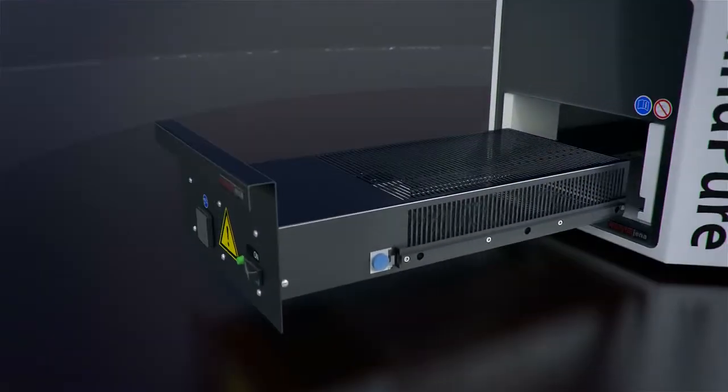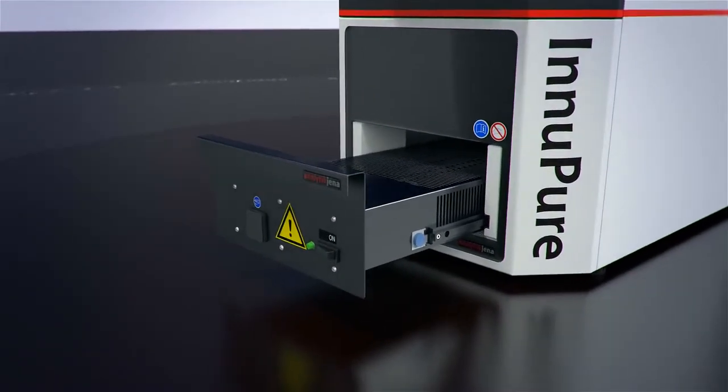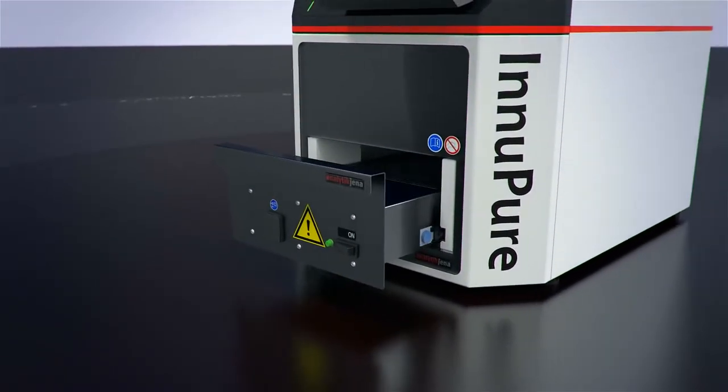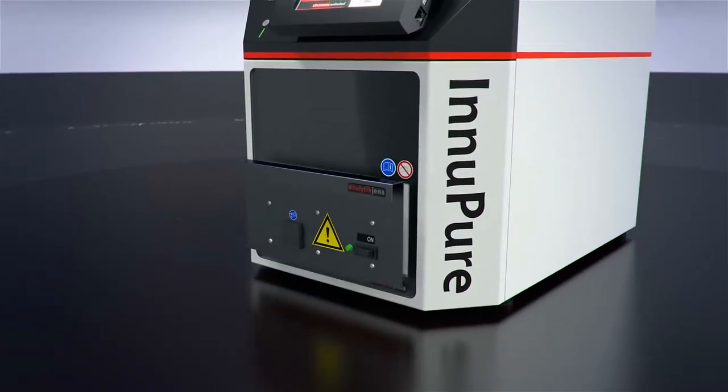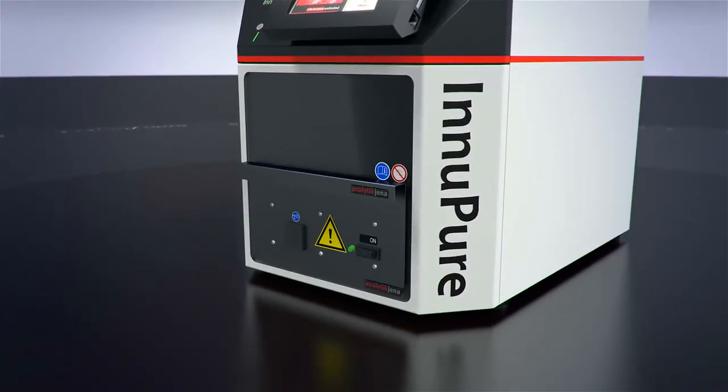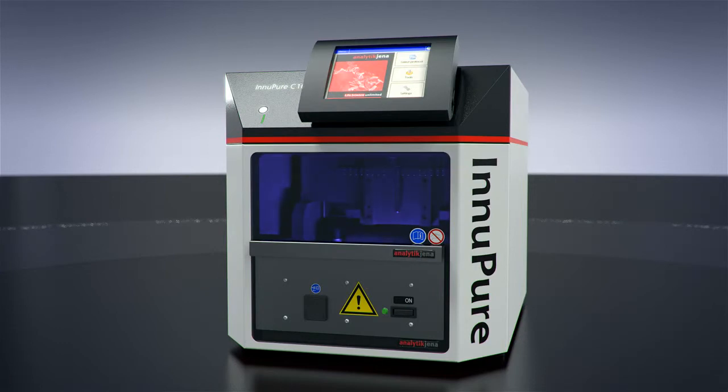A UV lamp with an integrated timer is provided for simple, effective decontamination of the automated system, which allows the InnoPure C16 to prepare additional extraction routines reliably.